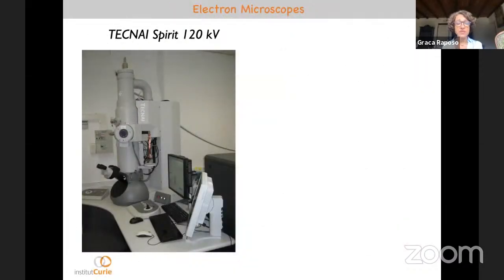I'm sure that most of you have seen a microscope. This is one of the microscopes we have at Institut Curie. This is a Tecnai 120 kilovolt. This is a very user-friendly microscope, I would say. Of course, now they are equipped with digital cameras, and we are very lucky. Maybe Carolina, when she was in Paris, we were still developing these negatives, is maybe sure of that. Now we have this chance to have these digital cameras that are very appropriate to directly have the electron micrographs.